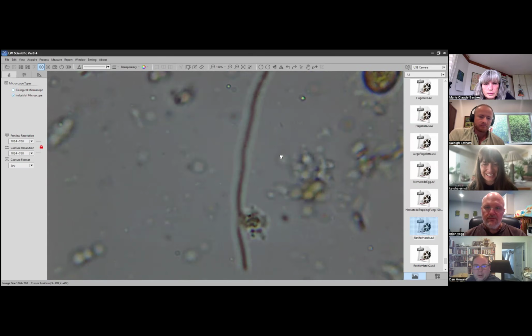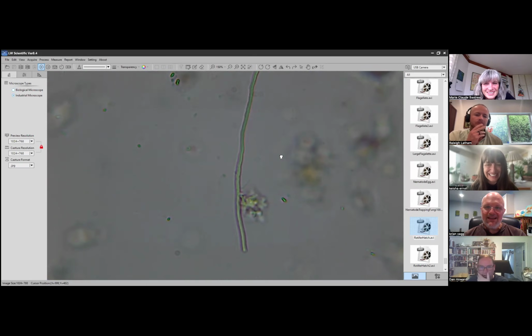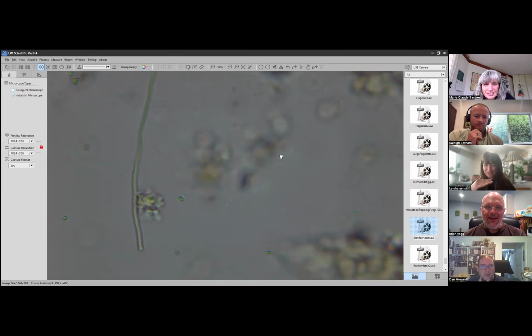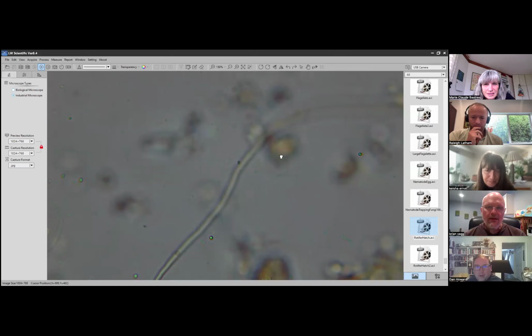It's interesting that the hyphae is showing up. It looks like a fiber optic cable or something. Yeah, it does, doesn't it? I'm certain that's fungi, though the tip is so broken off, so straight. Somebody asked, what's the zoomers? Can you pull it into?